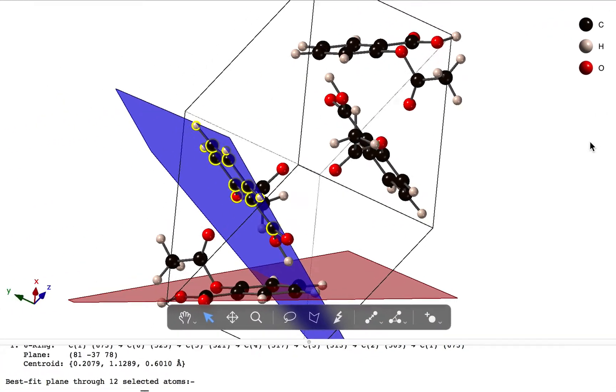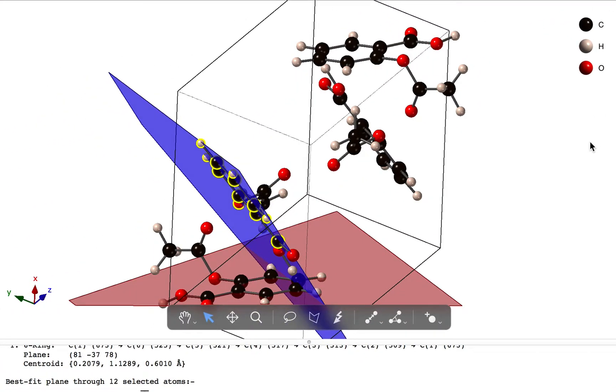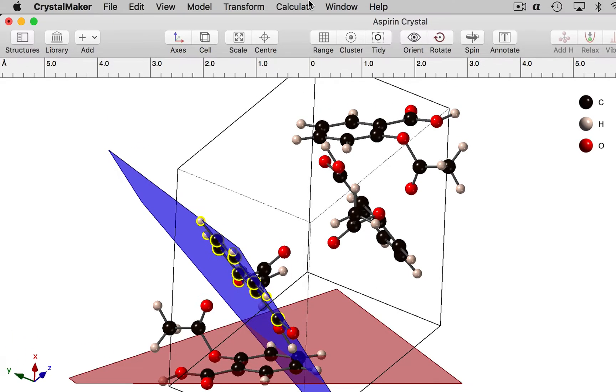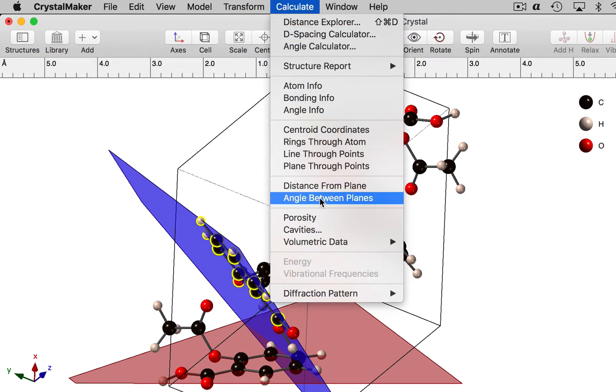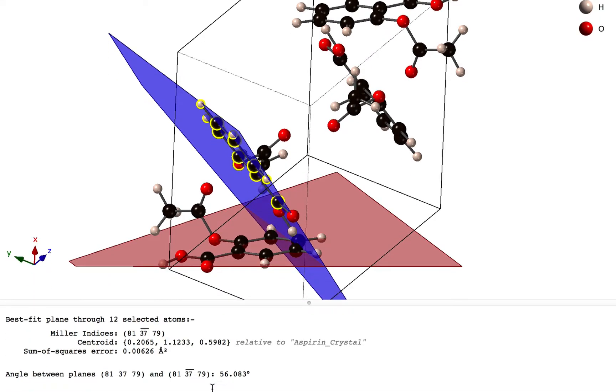Now how do we measure the angle between these two planes? Well it's very easy to do. We go to the calculate menu and we choose angle between planes, and here we have it: 56.1 degrees.